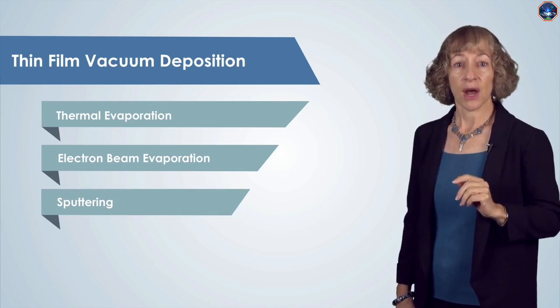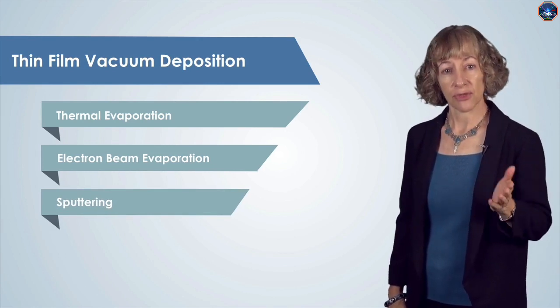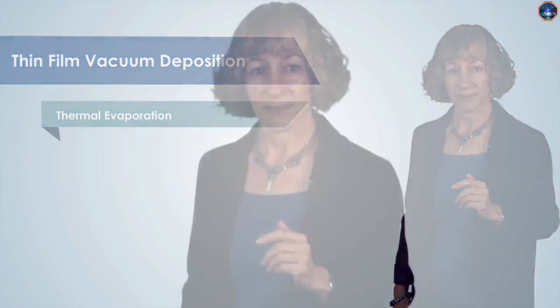In this video, I will introduce you to the process of thermal evaporation. Vacuum systems are used to deposit thin layers of ultra-high purity materials onto our samples and substrates because air molecules that are present during deposition will become impurities in our deposited films. So we remove the air from the chamber in which we are doing the film deposition using vacuum pumps.